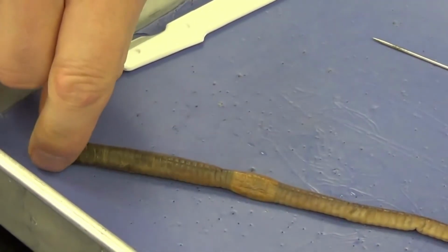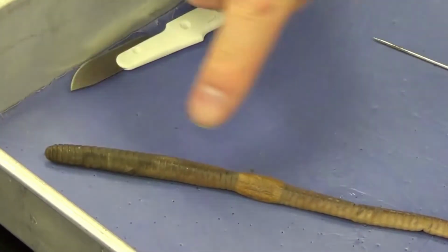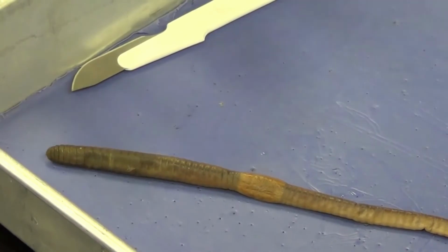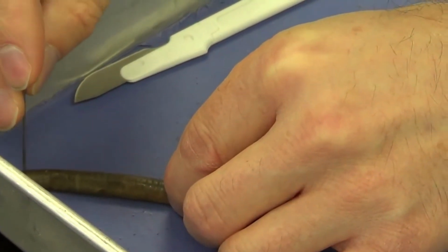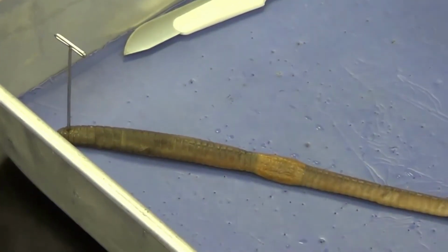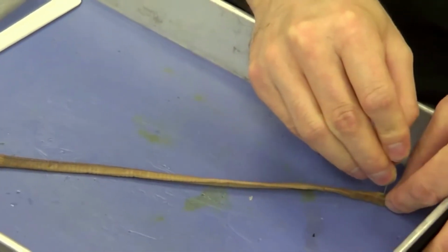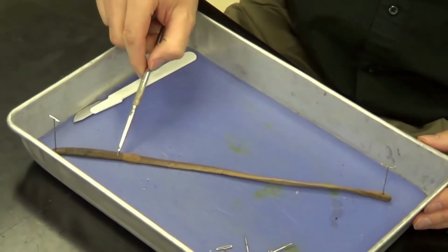And we have to put the dark side up. Now the dark side is very pigmented, and that is the side that needs to be up in order to see the organs. So I'm going to go ahead and put a pin straight in the anterior aspect of that earthworm, and then I'm going to take another pin and put it straight in the posterior aspect of the earthworm, just like that. And again, we want the dark side up.